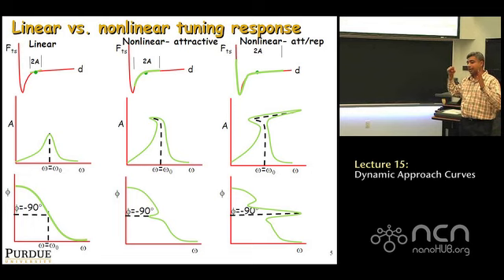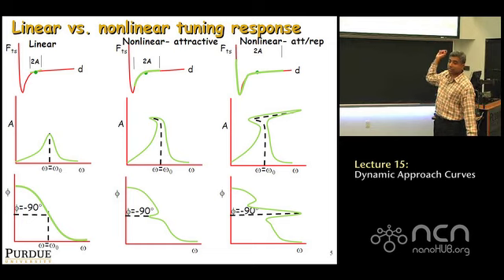In other words, the tip, not only does it come through the minimum of the interaction force, but it goes up all the way until the net force it experiences is actually positive. All right? That's what happens in the very top here. At any other place where you might be, as the tip oscillates, the net interaction force encountered is actually attractive.